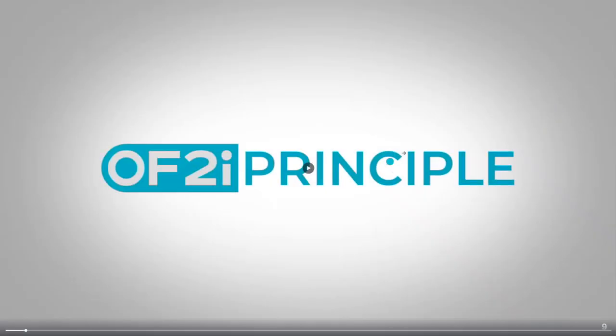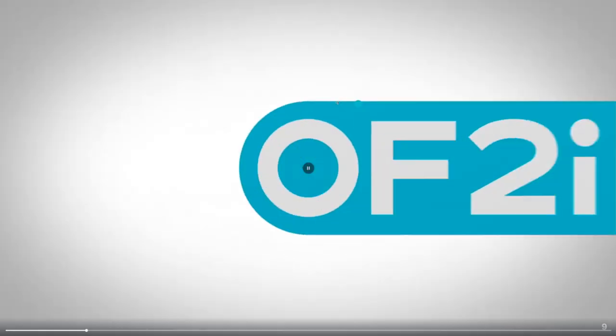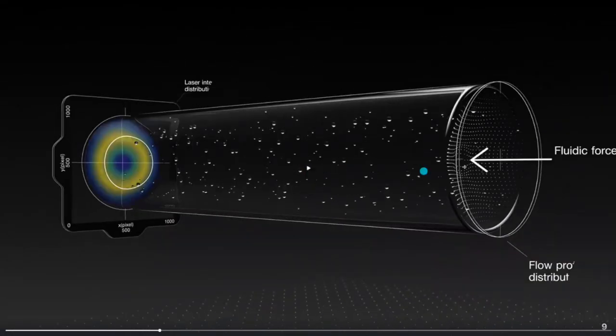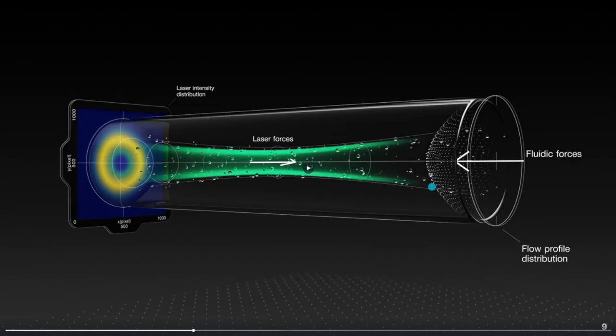The thing is, when you create a new principle, and OF2I is what we call our new principle, you really need to prove that it works. And first, I want to give you a short introduction to what OF2I really does. It works with particles in liquids. And those particles we pump through a capillary. This capillary is creating a laminar flow, and it's roughly 1.5 centimeters long and 1.5 millimeters in diameter, so we know exactly how, when we pump particles through here, how they flow, how fast they flow, and what their transportation through the capillary is.